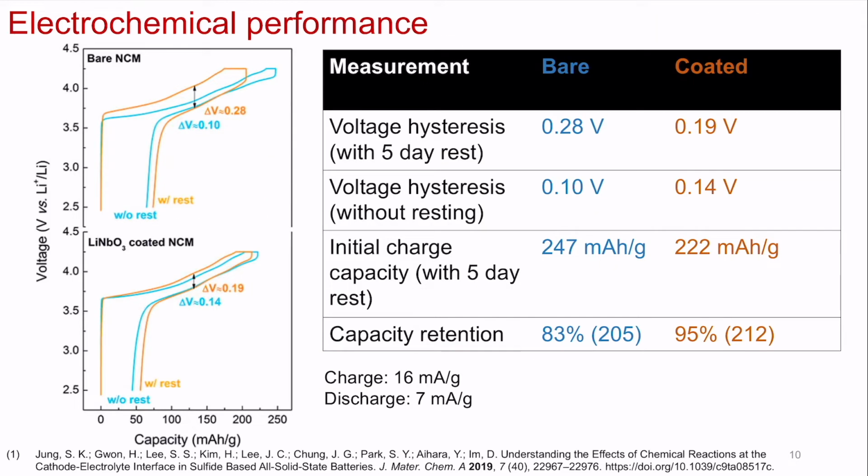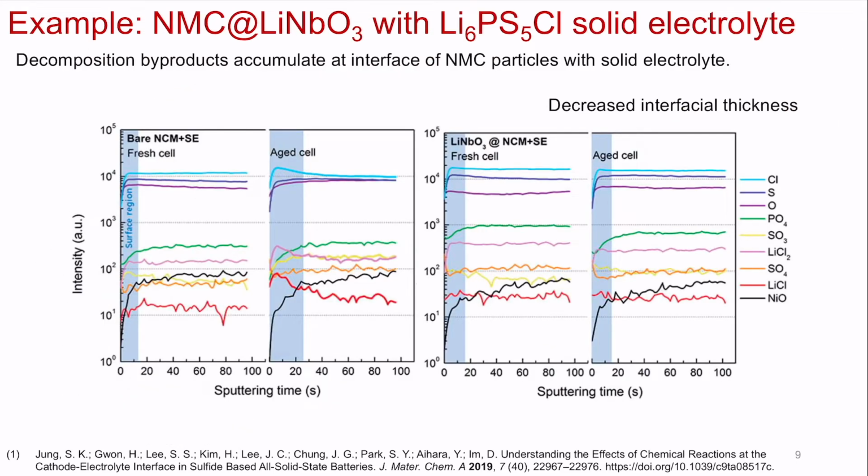Is the additional thickness from the coating layer not much of a difference? Like uncoated versus coating, you have to get through the coating layer too when etching it? Yeah, so the baseline is that there is some interfacial thickness, period.